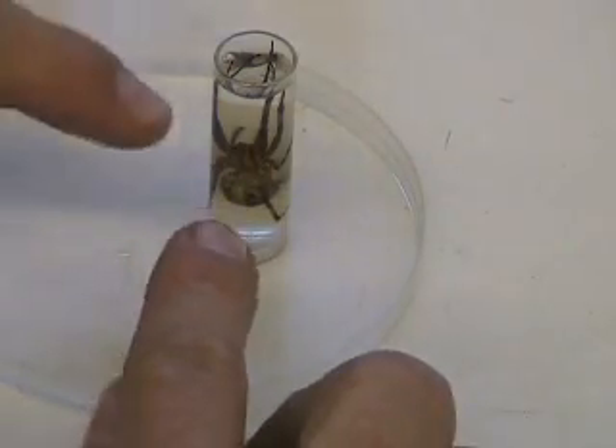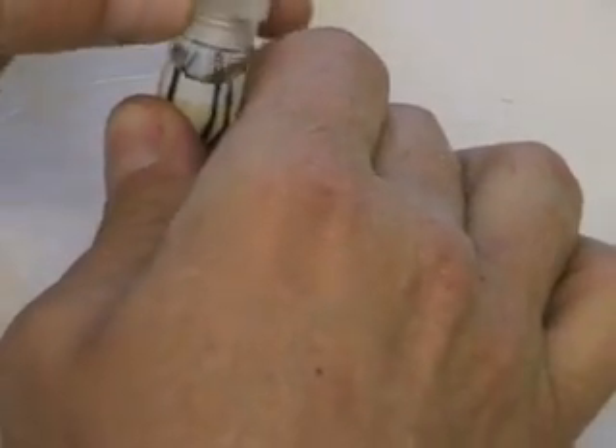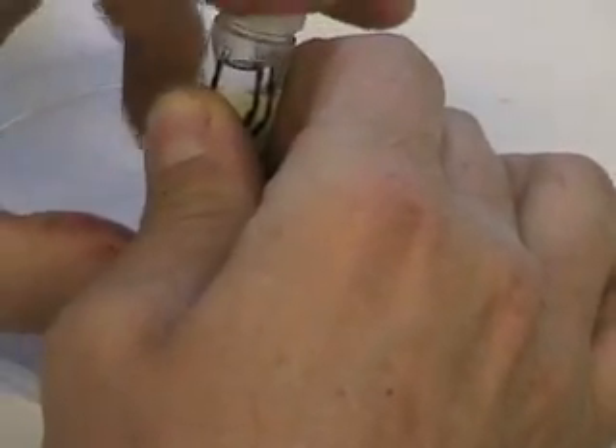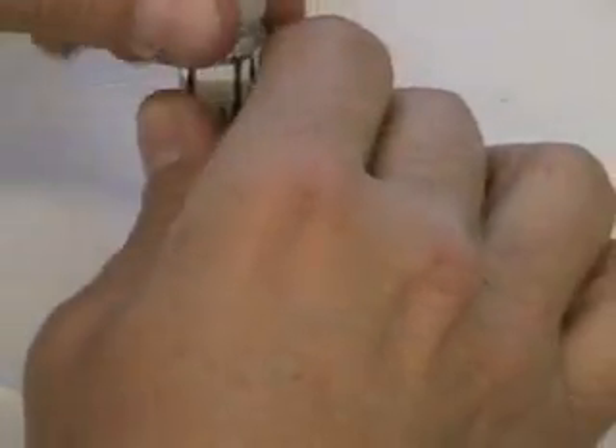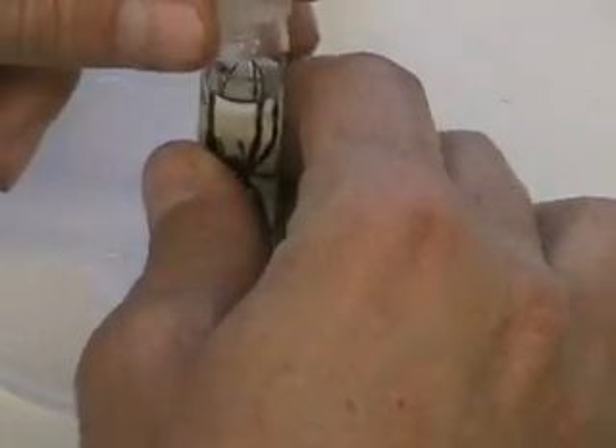When you're filling up a vial with ethanol, when you fill it to the top and put the cap back on, sometimes the gas in there will cause the cap to pop back up. So you want to let it sit for a couple of seconds so a lot of the fumes get out of the vial, and then put the cap back on.